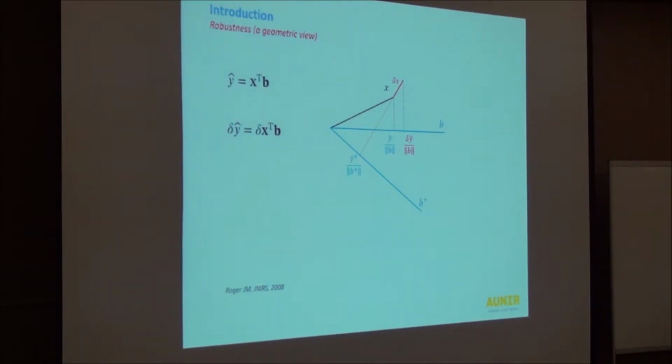And to determine that subspace of perturbation, we need repeat measurements. So we need samples, the same samples measured under different circumstances, and build the covariance filter or matrix out of that, and use that to orthogonalize the B vector. By the way, the covariance matrix has different names in the literature. They're called clutter, influence matrix, or interference matrix. You can call them by any of those names. Influence matrix is one of the popular ones.